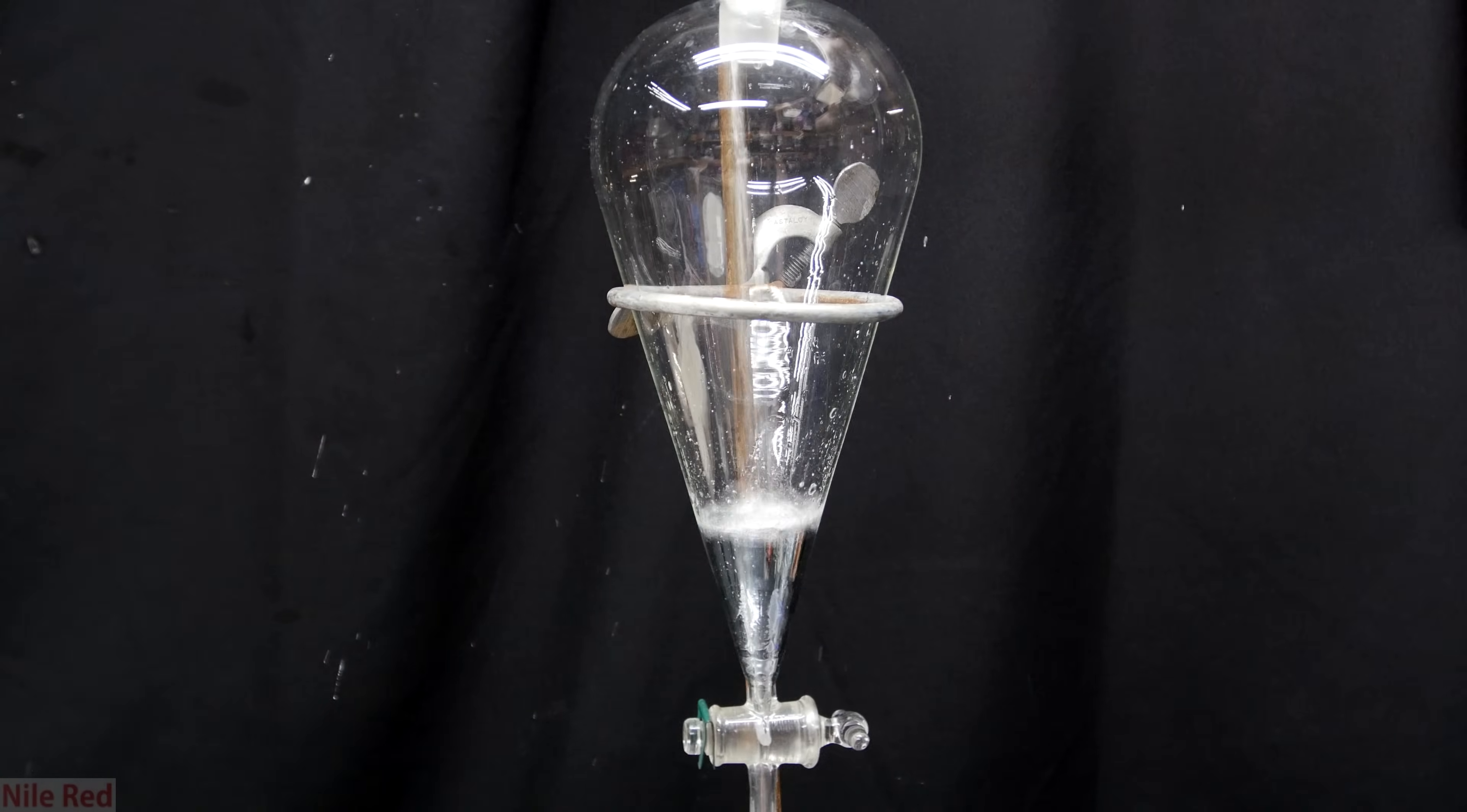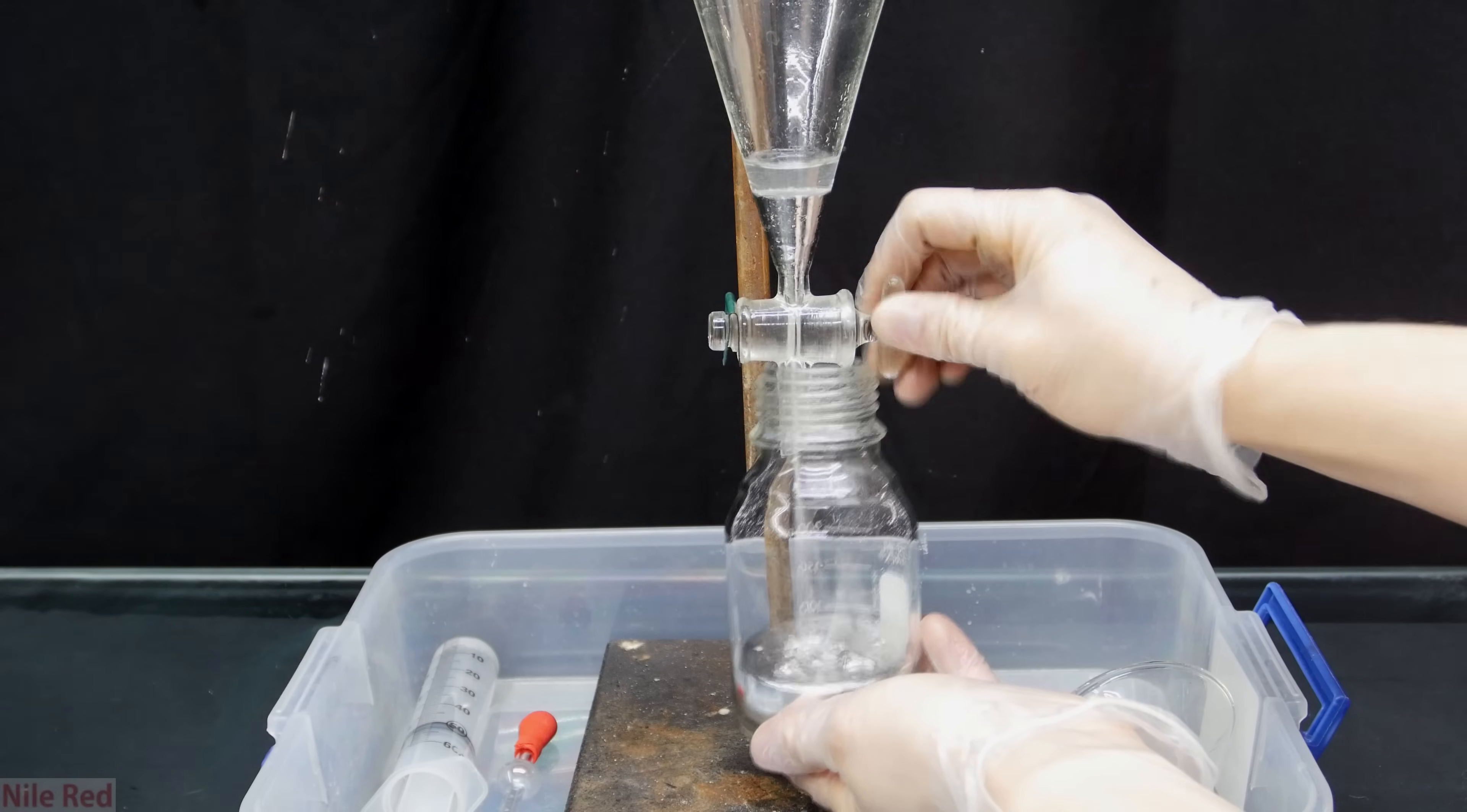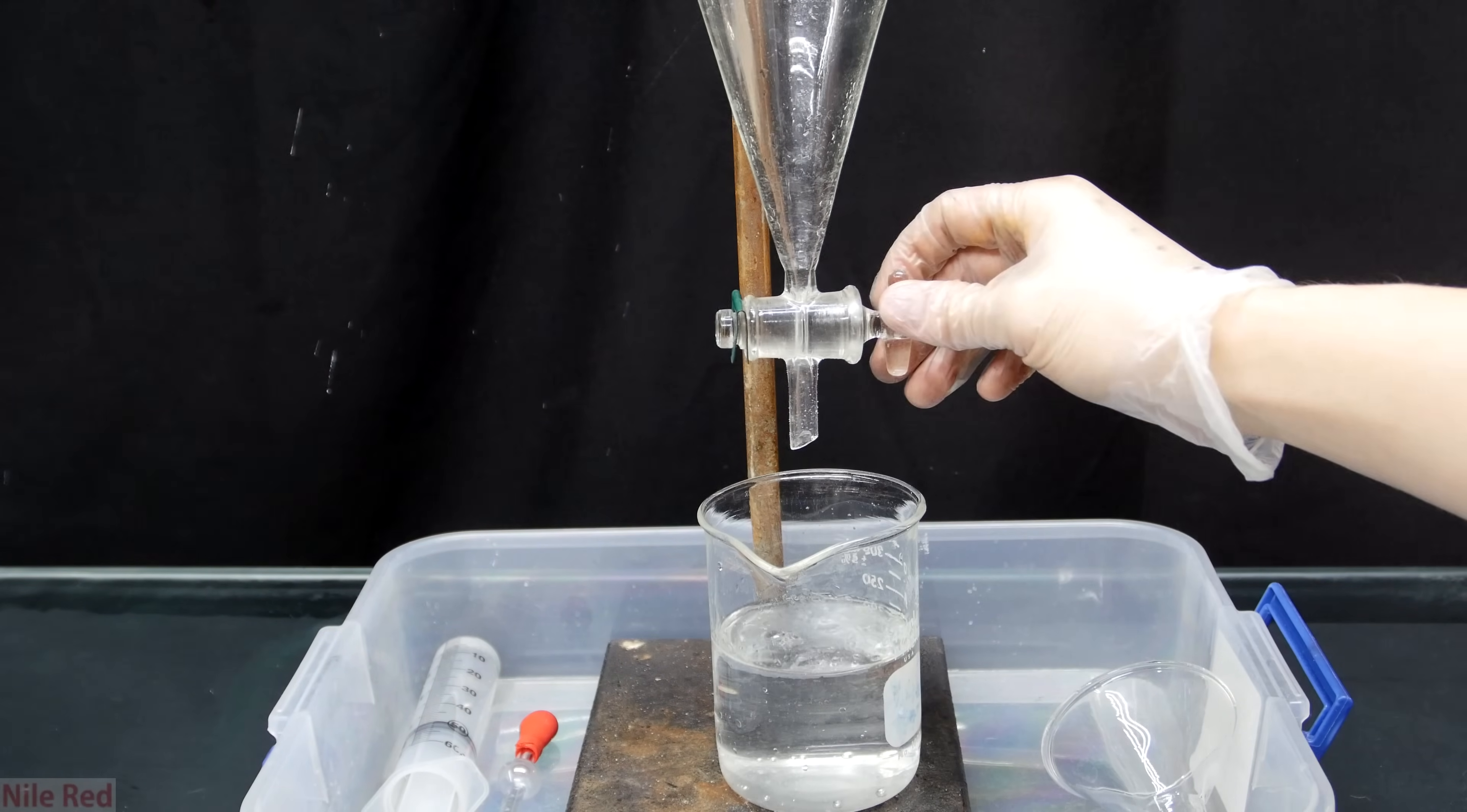So to continue cleaning up the mercury, it's poured into a separatory funnel. The mercury is then quickly drained back into the bottle so we can separate it from that oily water layer above. Once all the mercury is removed, we can place it to the side and then we can collect the water oil waste in a beaker.